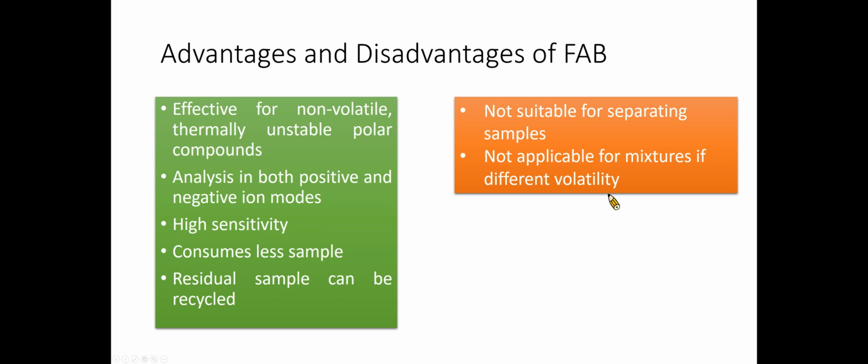However, FAB is not suitable for separating samples. It is difficult for FAB to separate samples with low proton affinity from samples with high proton affinity. Moreover, for samples that are mixtures of different volatility, FAB cannot fractionate and ionize the components.